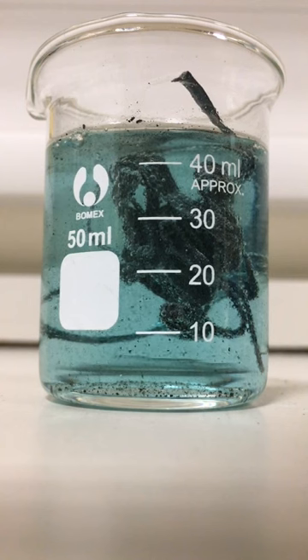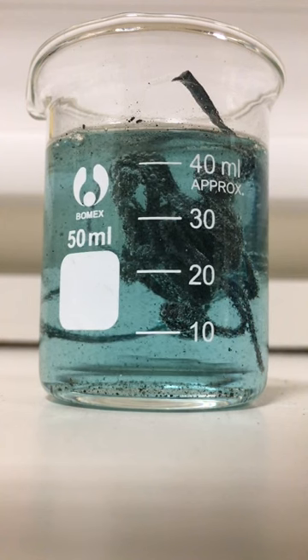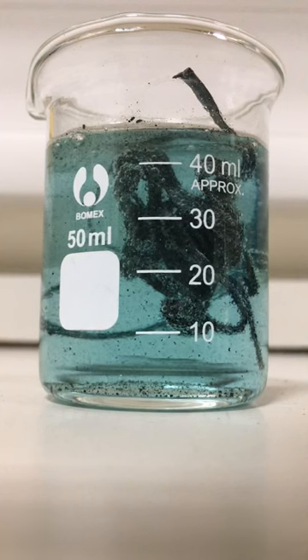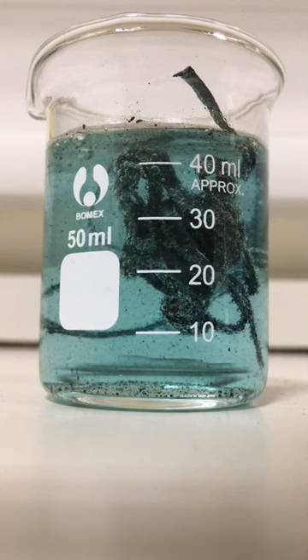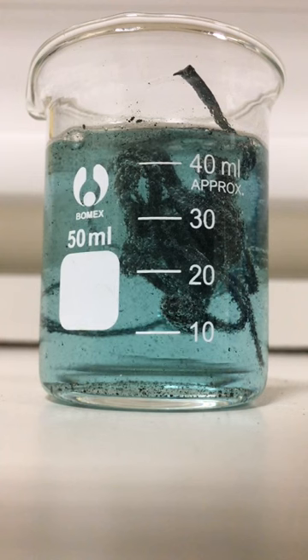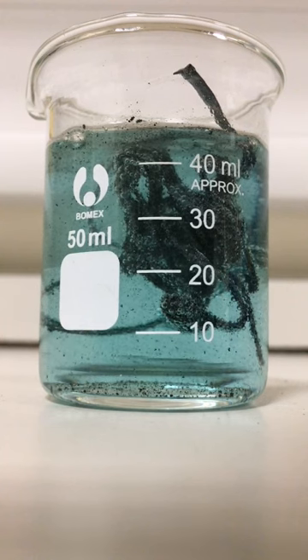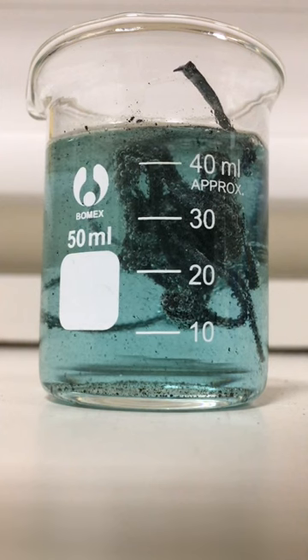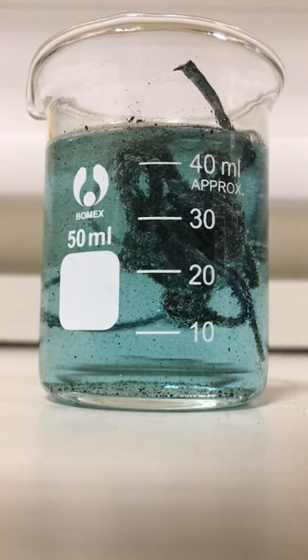And it's always nice to see a couple of things. One is as the bubbles of hydrogen coalesce around the outside of the magnesium, it causes it to float a bit more and rattle up and down and move around as if by magic, but it's better than magic, it's science, right? The other thing the IB like to ask about this is because the colour will actually fade.